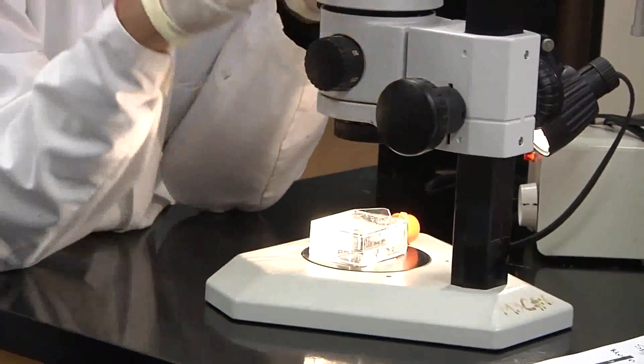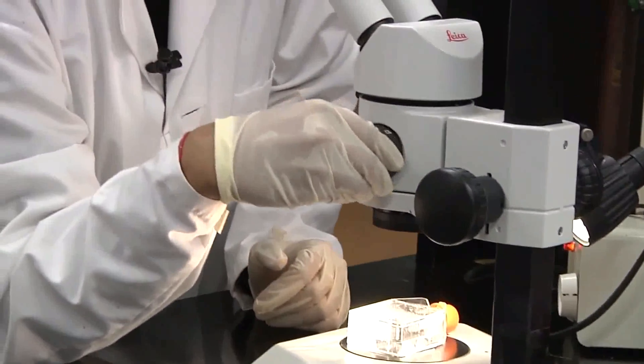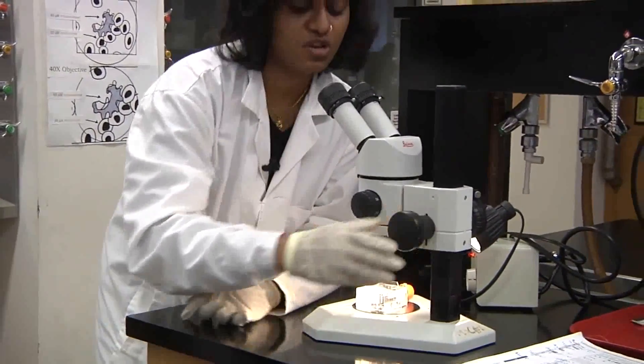Once you are in focus with one of the specimens, increase your objective to 16 or 14 times, and focus it with a coarse adjustment knob.